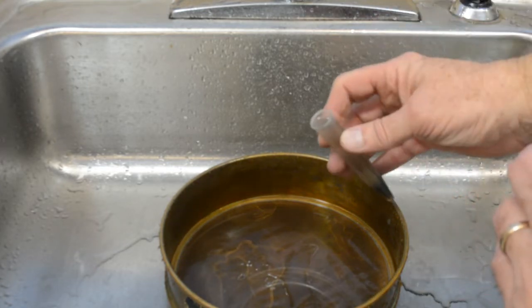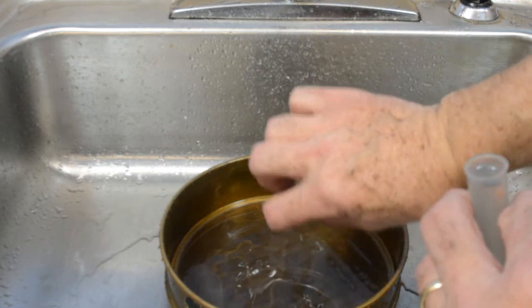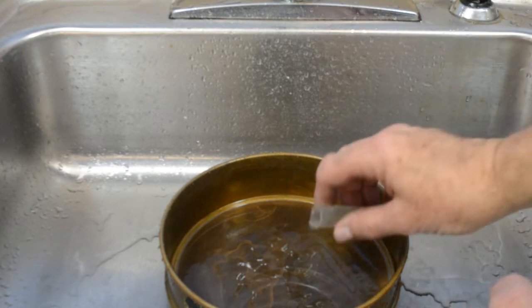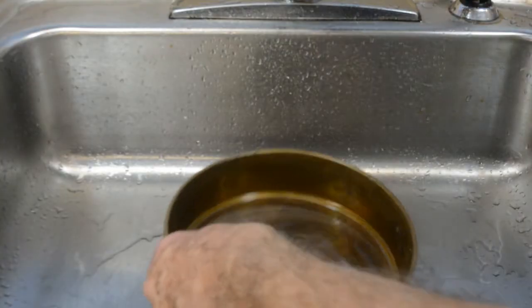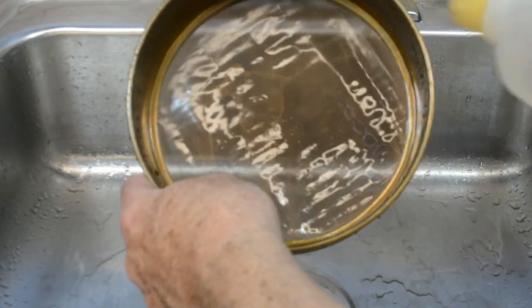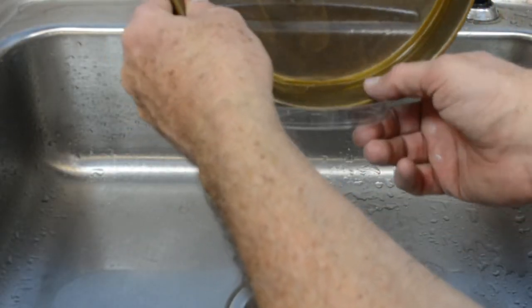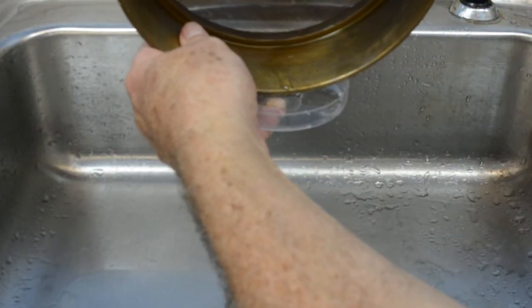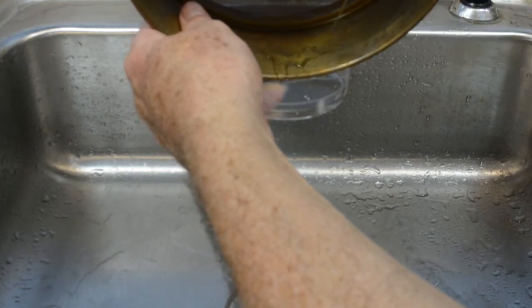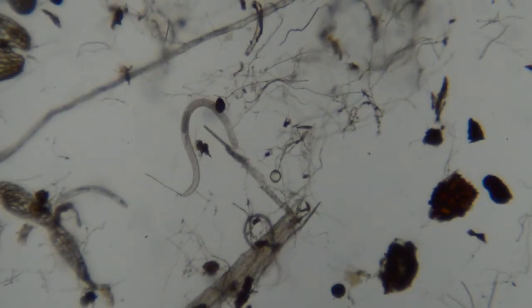After the centrifugation, the tubes are then decanted, this time into the 325 mesh sieve. This will allow the sugar water to drain. The wash bottle containing water is then used to remove any remaining sugar solution. Once the material is washed, it is then transferred to a clean dish. The dish can then be inspected using a dissecting scope.